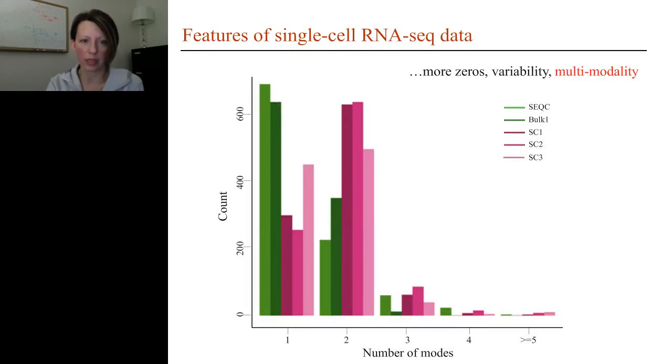Just a second, getting a question. So the question is, how do you define bulk? And what I mean by bulk RNA-seq is not single-cell RNA-seq. So traditional RNA-seq is what I mean by bulk RNA-seq. Thank you for the question.